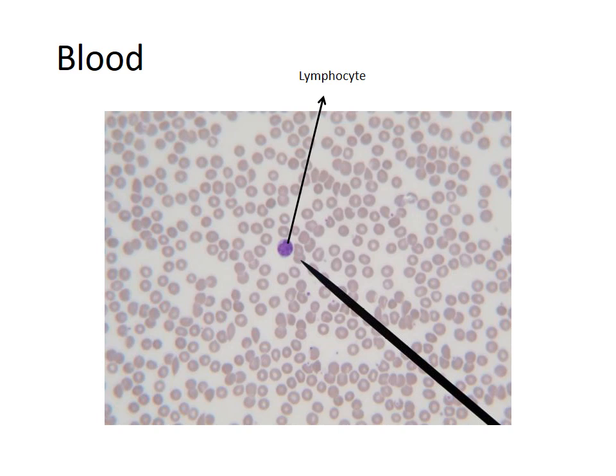The very first one is called a lymphocyte, and as you can probably guess, it's going to be associated with the lymphatic system. If you've ever heard of T cells or B cells, which are what we consider our immune system, they are both lymphocytes, and we're going to look at this when we get into the lymphatic chapter. The lymphocytes are really amazing cells. Outside of a neuron, they're probably the most amazing cell in the body. They can live outside of the circulatory system for decades. They actually learn how to fight specific diseases, and then they hang back as memory cells waiting for our body to get invaded again. We'll talk about that at another time, but I'm going to show you the next picture, which is the better picture of it.